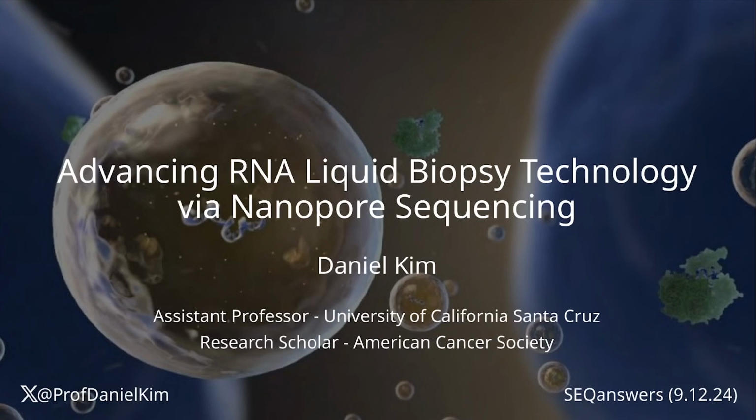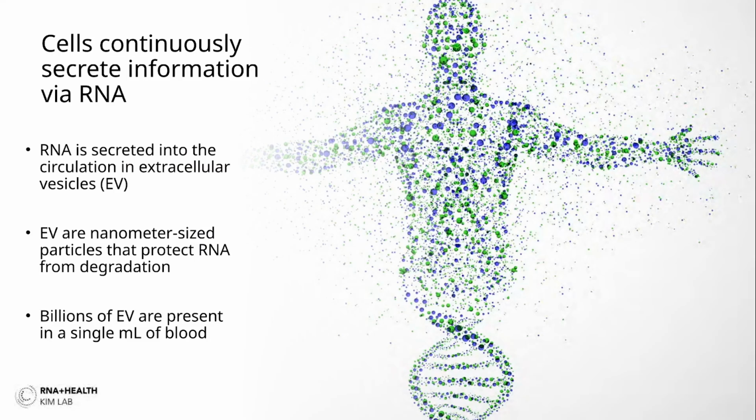So I'm really excited to tell you about some of the work that my lab has been doing to advance some RNA-based liquid biopsy technology using the nanopore sequencing technology that Ellie kindly introduced for us. And so I'll be telling you about work that we've been doing over the past few years to really enable this platform to diagnose cancer at the earliest stages.